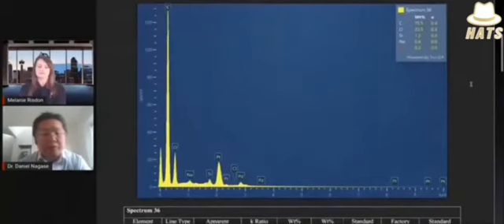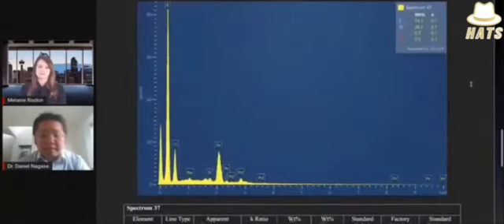If this was a salt crystal, we'd expect to see sodium and chloride. And what do we see? In square 36, it's carbon, oxygen, a little bit of sodium, a little bit of chloride. And it's carbon, oxygen, platinum, which was an artifact because we added that to the sample, and a little bit of silicon. That's really unusual. Let's scroll down to spectrum 37. In that particular square, there's only a tiny bit of sodium, no detectable chloride, and it's carbon, oxygen with a very little bit of silicon.